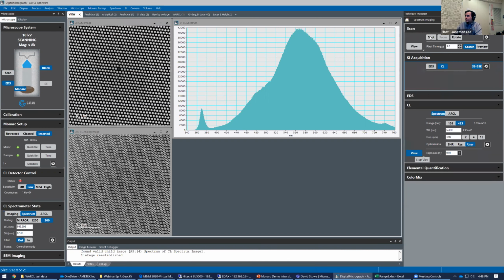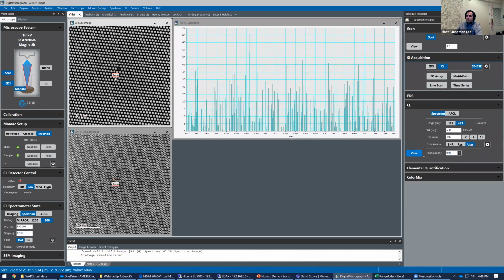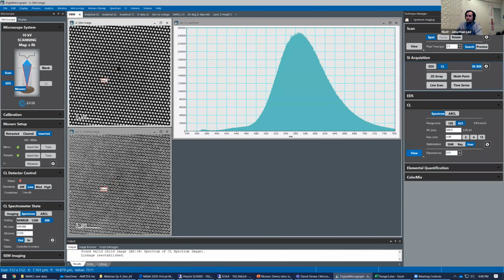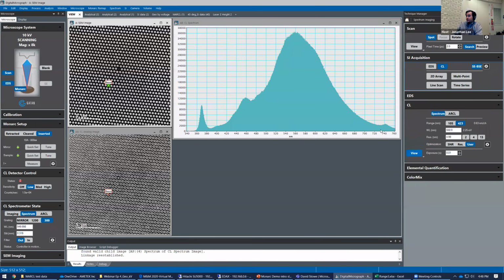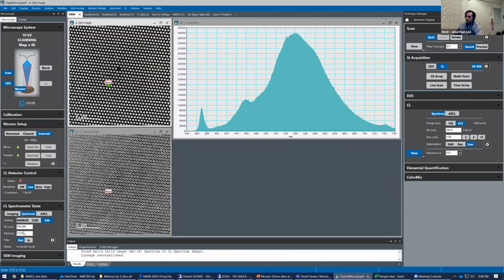We can view the camera. It's moving into position. There we go. So there's a lot of spectral activity, and you want to make sure that you're capturing as much of it as you can in general. But the slit size is controlling. Over here you have the entrance slit size in millimeters, and it's controlling the resolution in wavelength. If we reduce the slit size, it's obviously going to reduce the amount of light that's able to couple back into the system because we're introducing an aperture, but it will also improve the spectral resolution.